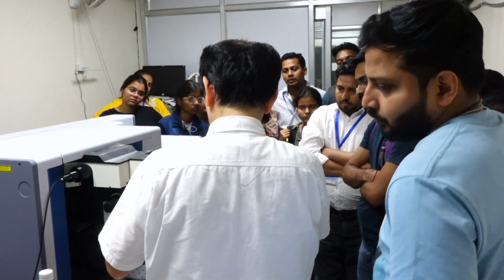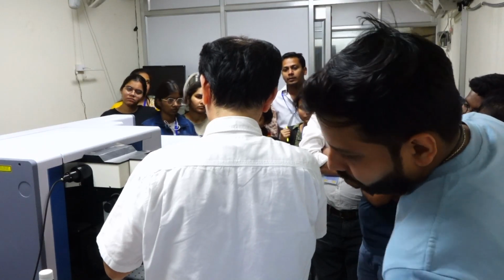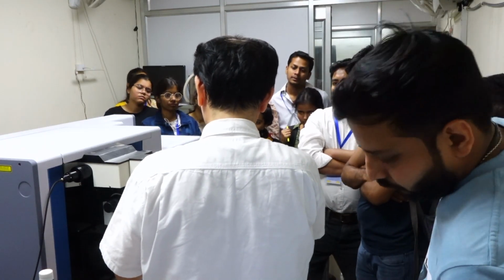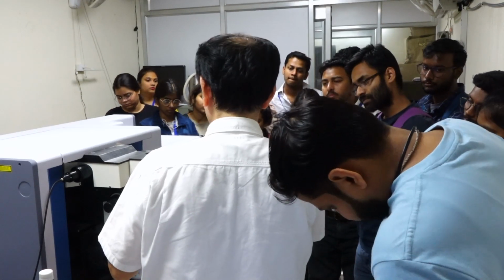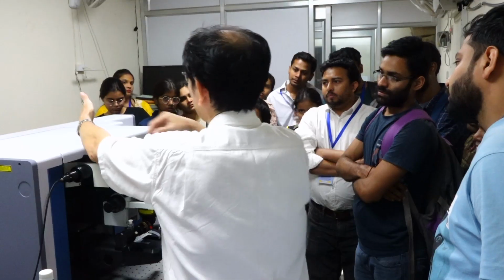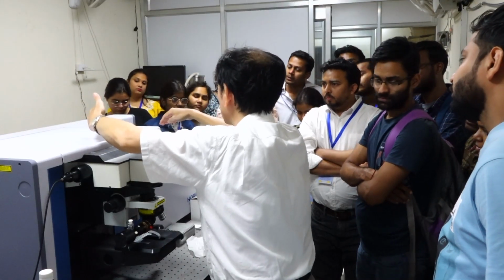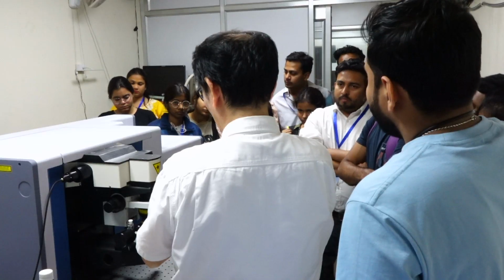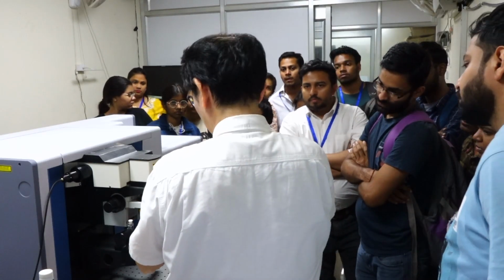And the Raman scattering from the cuvette is collected, and this is also the back scattering. It is collected, transferred to the dichroic mirror and transferred to the monochromator. So it facilitates measurement of the liquid sample.